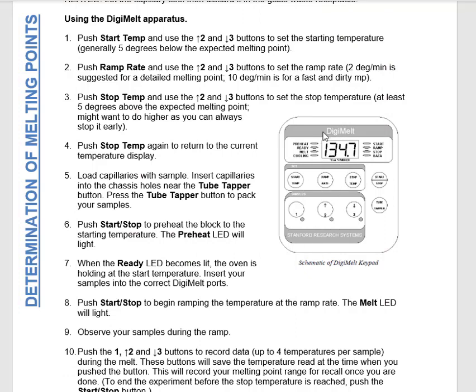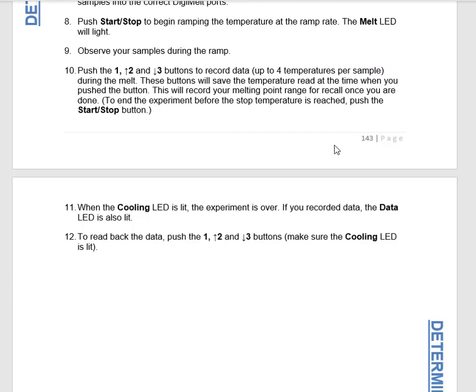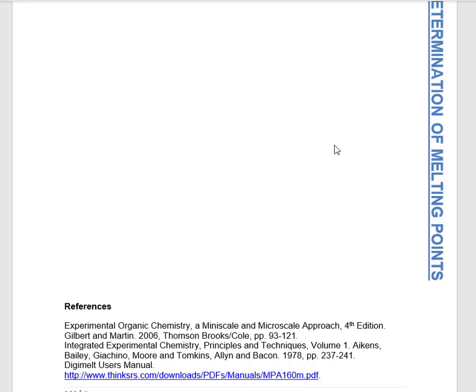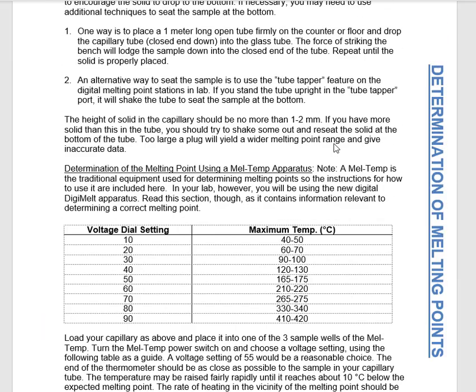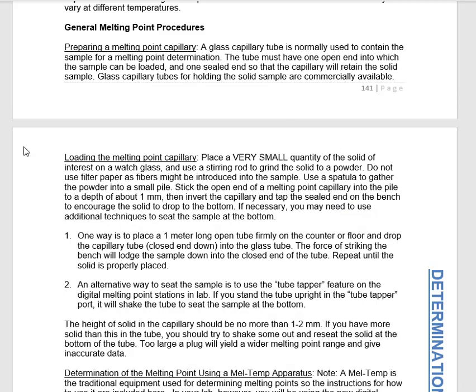And then there is a readout here. It's a nice little red digital readout that you can see. So you'll be looking in a window to see if your solid has melted, but then you're also going to have to check this readout right here to see at what temperature it's melting. Okay. All right. So that should at least get you mostly prepared for what's about to happen. All right. Good luck.